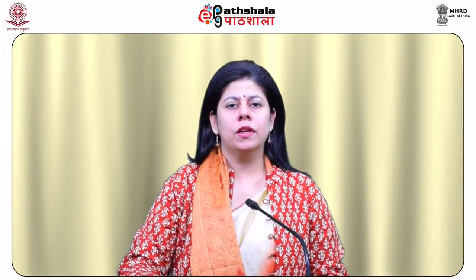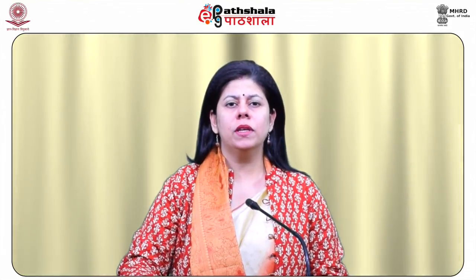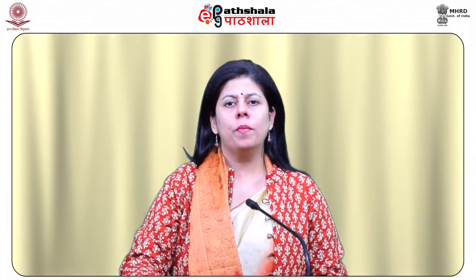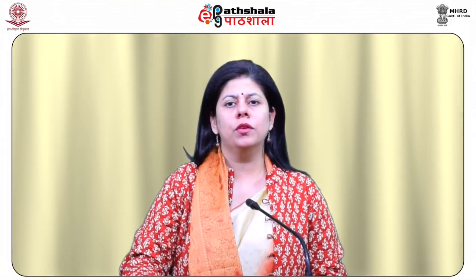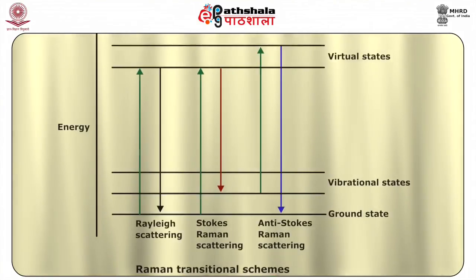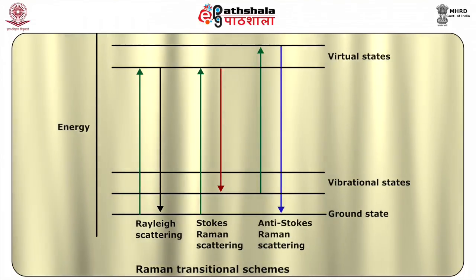Spontaneous Raman scattering is very weak and special measures should be taken to differentiate it from the predominant Rayleigh scattering. Instruments such as notch filters, tunable filters, laser stop apertures, and double and triple spectrometric systems are used to reduce Rayleigh scattering and obtain high quality Raman spectra. You can see Raman transitional schemes for Rayleigh scattering, Stokes Raman scattering and anti-Stokes Raman scattering.